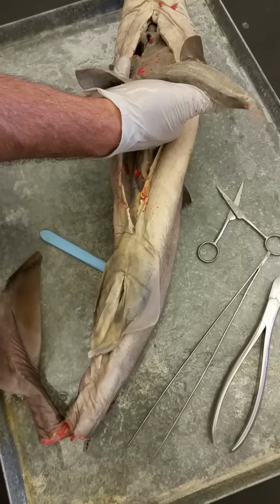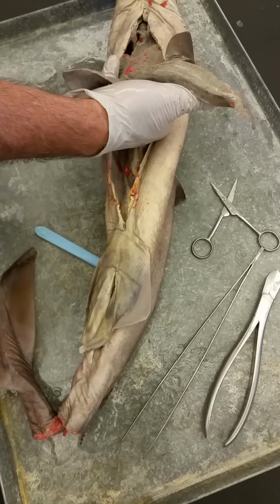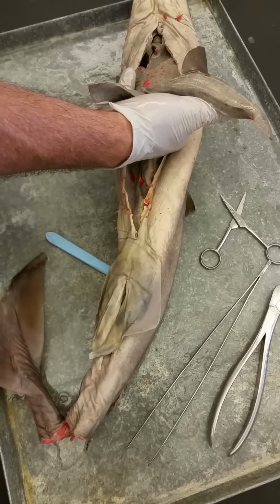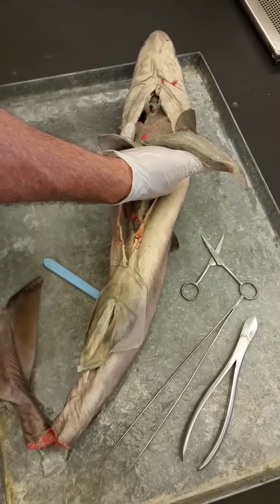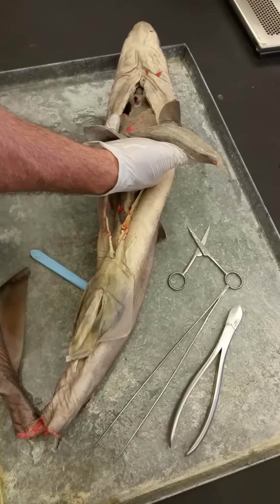Pressure-volume ratios, right? Just like we did in our gas exchange lab exercise. So if a bony fish changes depth, its swim bladder changes size faster than they can fill it with oxygen. And so if it comes up, all of a sudden it's going to overexpand, it's going to become buoyant. If it goes down, it's going to constrict, it's going to be heavy. And so it's changing its ability to be buoyant depending on the depth.